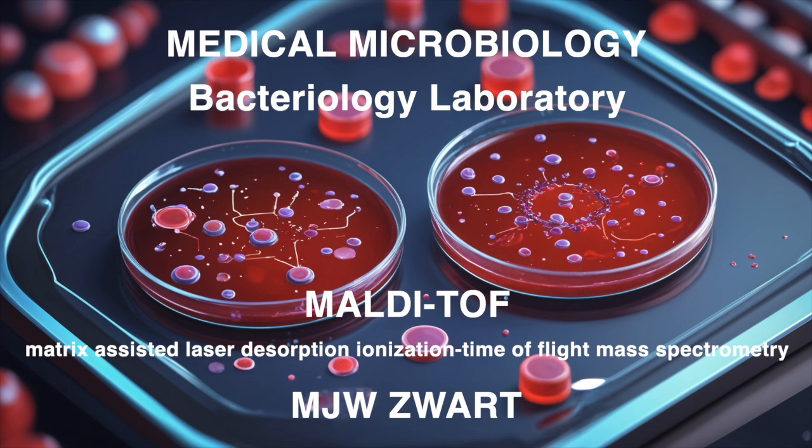Precisely. But of course, safety first. Always. Absolutely. The document reminds us to wear gloves and work in a fume hood when handling formic acid. And never forget that rule: always add acid to water, not the other way around. Yeah, safety first. Similar precautions apply when you're preparing trifluoroacetic acid, TFA, at 80%, right? You got it. Both acids, you've got to handle them with care and dilute them precisely for safety and to make sure you're prepping them correctly.